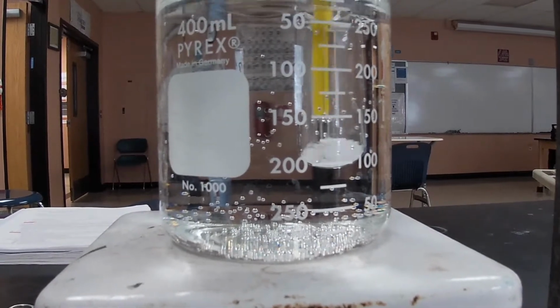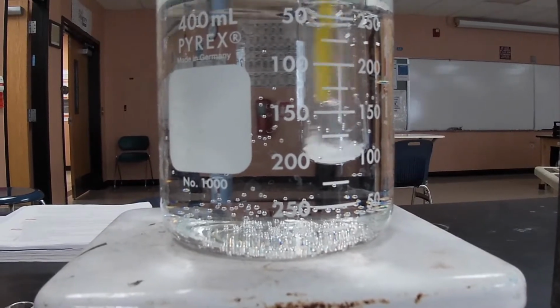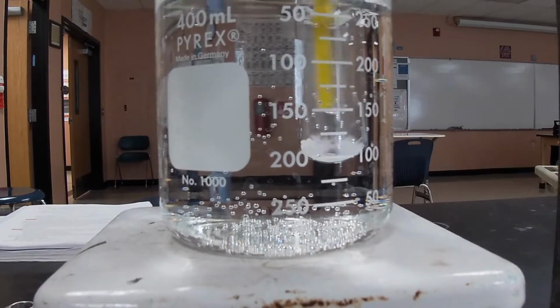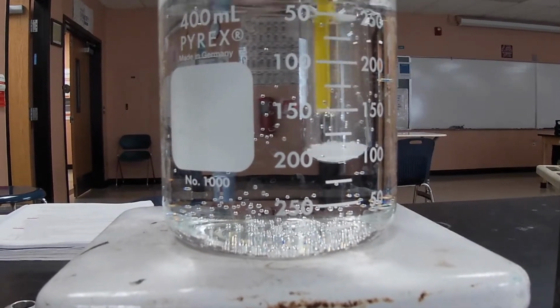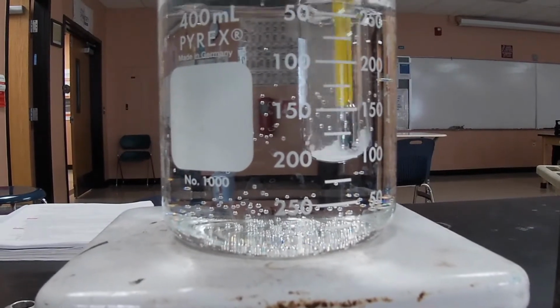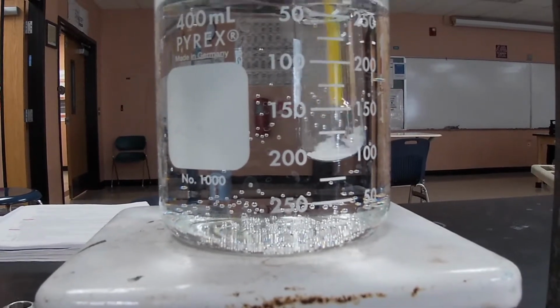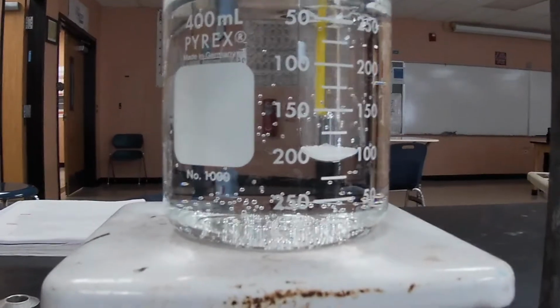Okay, and then like I said, we're gonna continue this until it is completely dissolved, and I'm gonna take it out of the heat. And once I take it out of the heat, I'm gonna allow it to cool and stir slightly gently until I see some crystallization form. And once I see the crystallization forming, I record the temperature, and then I cannot stir anymore. Okay, so we'll come back.